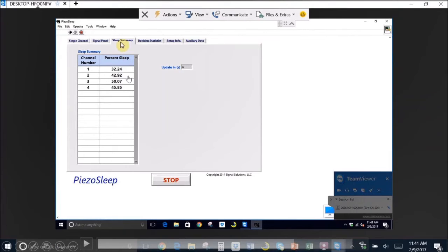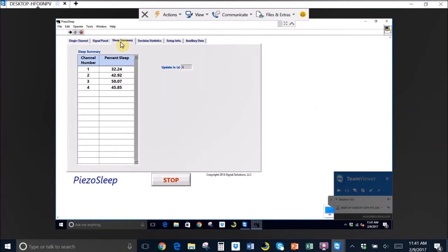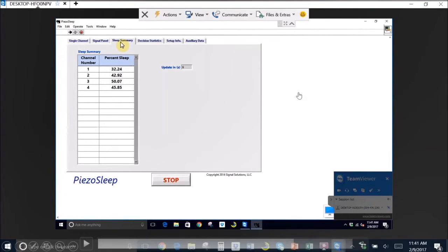Next, you can look at a sleep summary after a few hours or a day or 2 days. People typically, for sleep studies on these, might do anywhere from 3 days to a week or even many months if you want more circadian type variables or longer term sleep studies. Again, since our system's automatically scored, no limit to doing 60 days straight of recording. You have to change the cages once a week like normal, but that's about it.